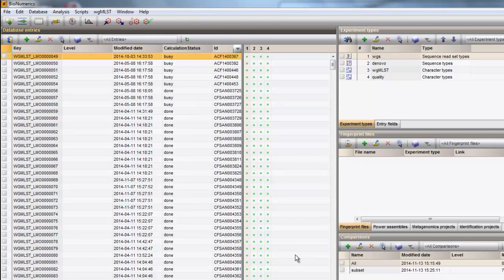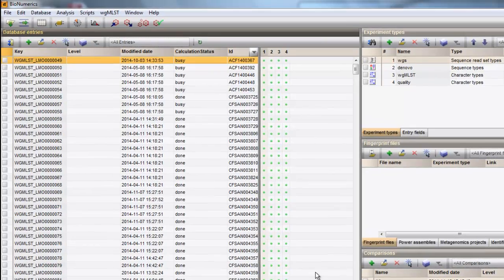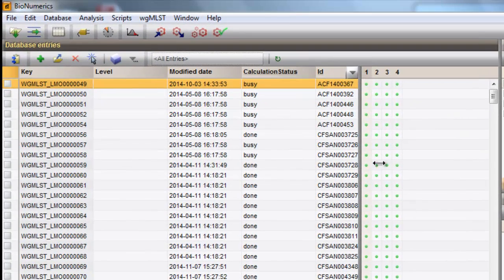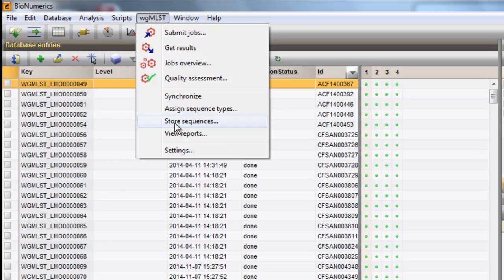Remember, you can always adjust the calculation engine settings from the main window by going to Whole Genome MLST, Settings.